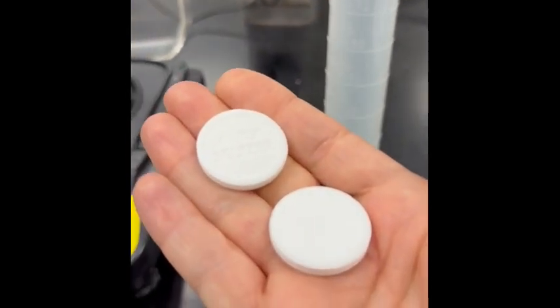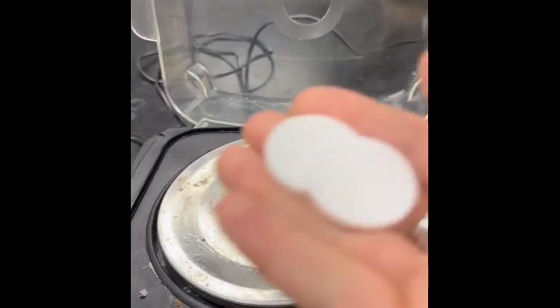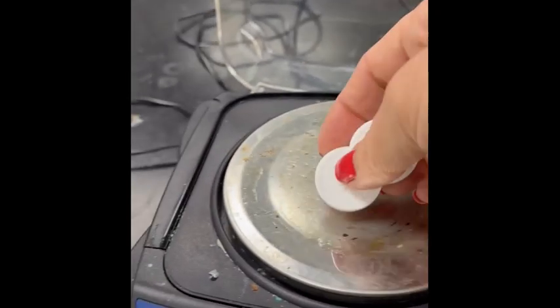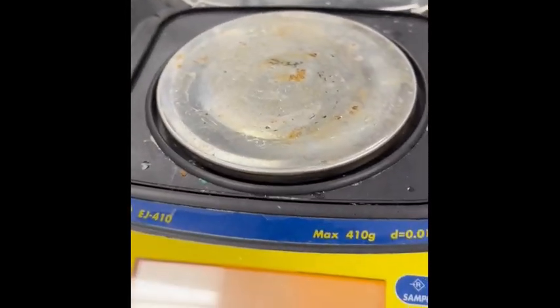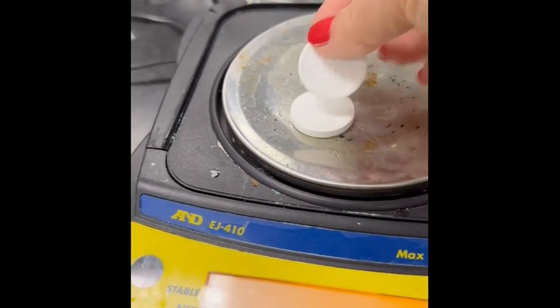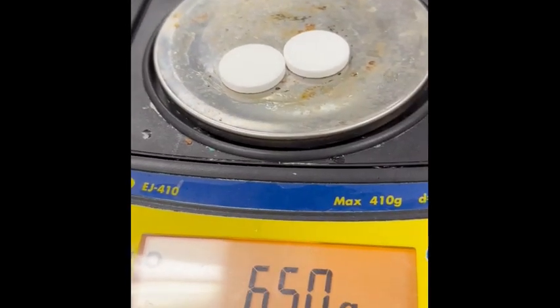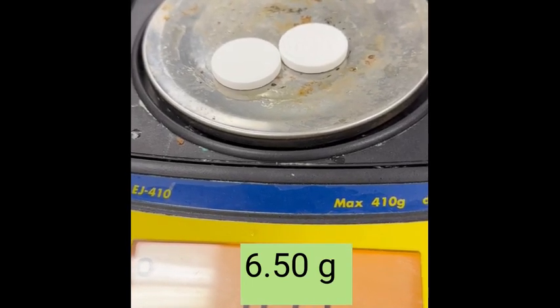So what we're going to do is weigh two tablets, and I'm going to ask you to make sure that you record the mass for these two tablets. I'm going to turn on the balance here. We're going to set it to 0, and we're going to weigh the two tablets. So the two tablets themselves weigh 6.50 grams.